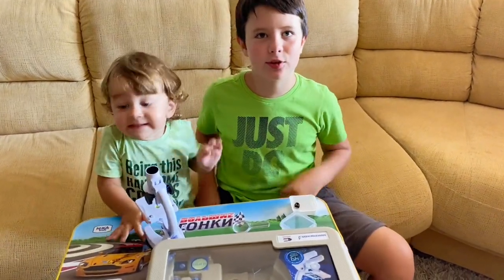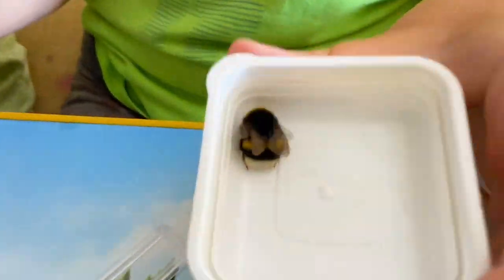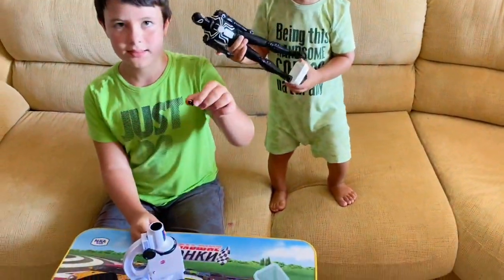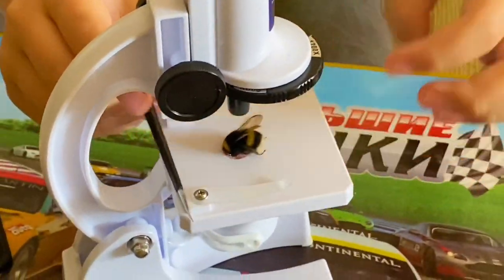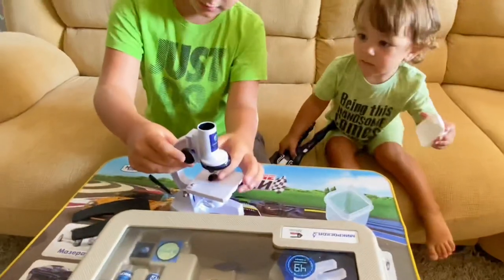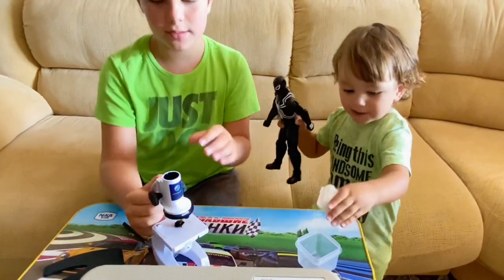Hi guys, today we're going to be microscoping a bee. Here it is. Now we're going to put him into the contraption. We're going to just make it a little bit bigger so you can see him a lot more closer. Now we look.